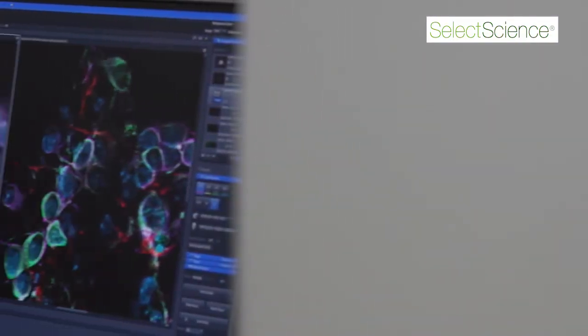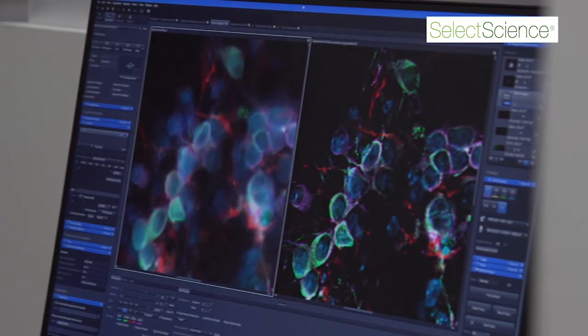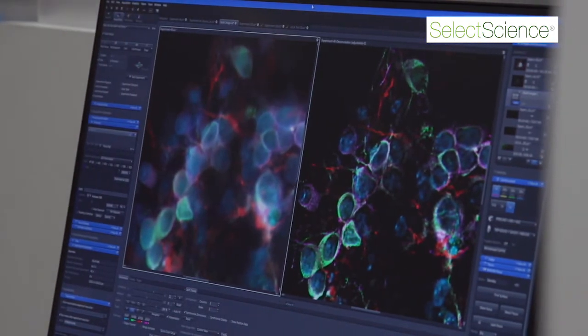It has an extremely automated concept to allow you to get the best image possible, with an optical concept that automatically corrects for the type of dish or plate you might be using, as well as integrated incubation that has heating and cooling, humidity, and CO2.